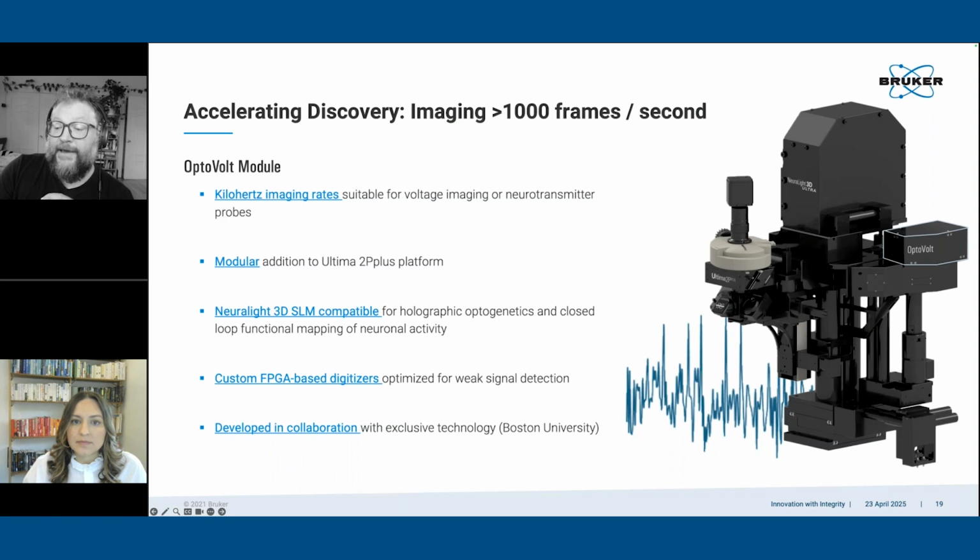You are limited by certain things when you start fiber coupling. For example, if you want to use really wide aperture lenses, there are issues of beam size. But when it comes to miniaturizing, that has really been a boon, because the ability to fiber couple with a 2P laser means you can actually have something moving.